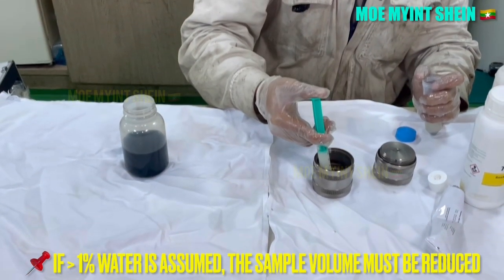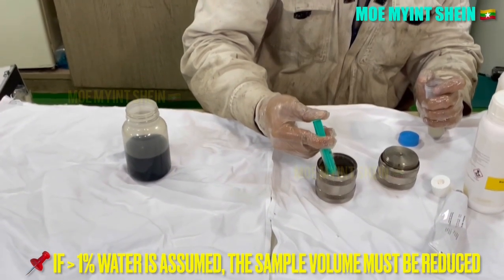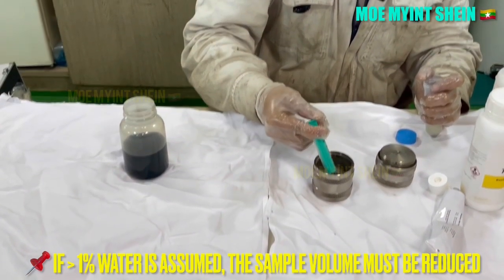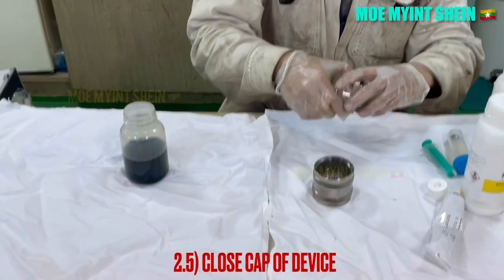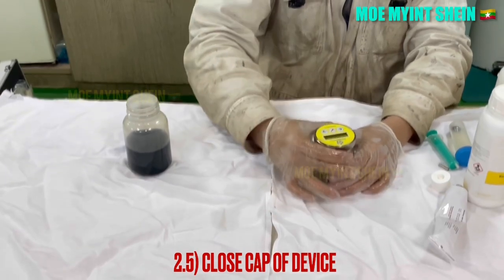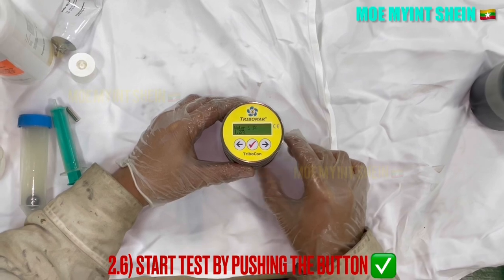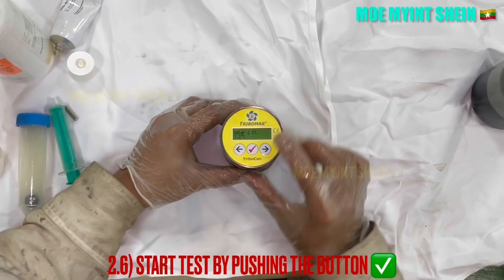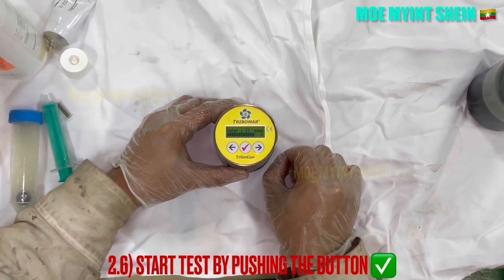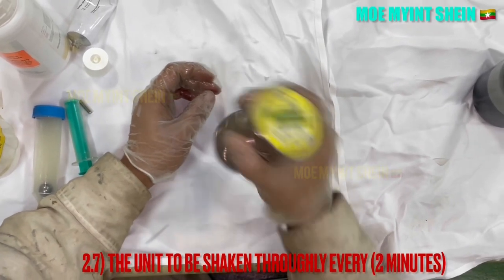If you assume the water content is greater than 1%, the sample volume must be reduced. Close the cup of the device. After then, start the test by pressing the right marked button on the cup. The unit needs to be shaken well every 2 minutes.